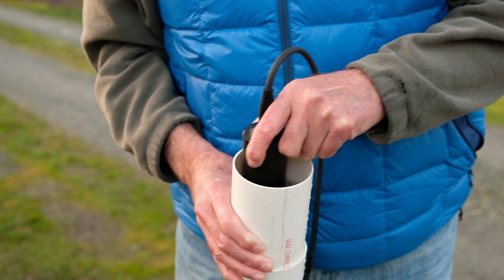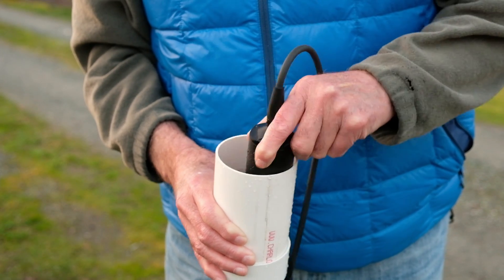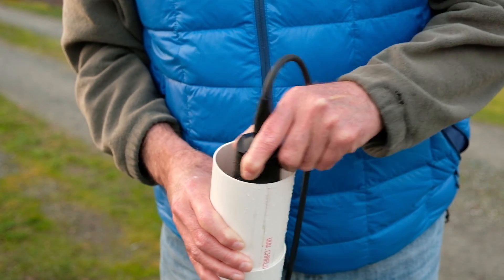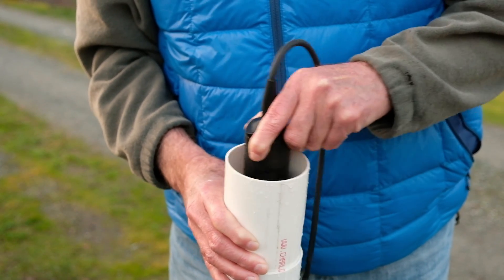I'm conforming to the diameter of the cup and spinning fast enough — and I'm still reading twelve point three, twelve point three two. This is consistently working.